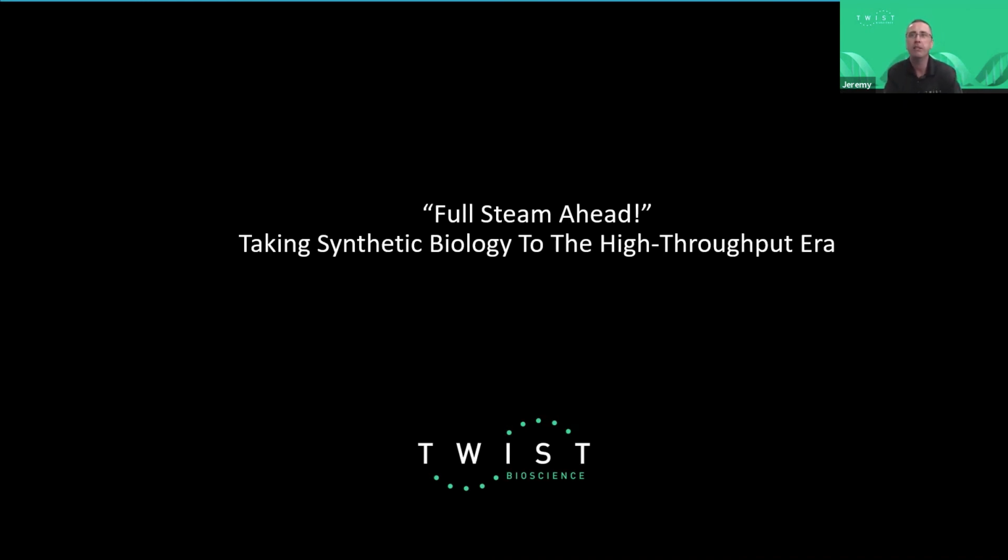Will there be more flexibility in allowing biological entities such as bacteriophages to be engineered in the BioFoundry? Are there considerations given to potential contamination by other organisms? Hi, Karen. At this stage, no, there isn't any plan to introduce the phage or any other organism like that into the BioFoundry.